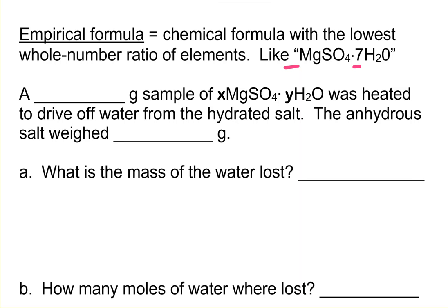So let's look at how the data would be. We're going to have a mass of the salt before it's heated, and after we heat it and those water molecules leave, we'll have a lower mass. Okay, and you need to know what these numbers represent. So the number when it starts, when you have the crystal, this is with water.